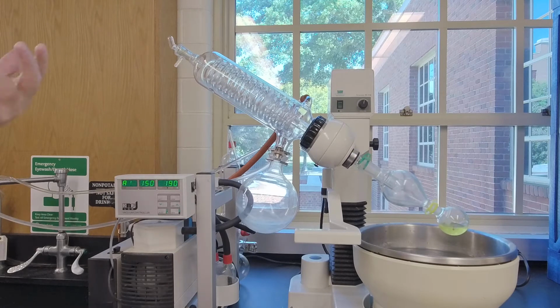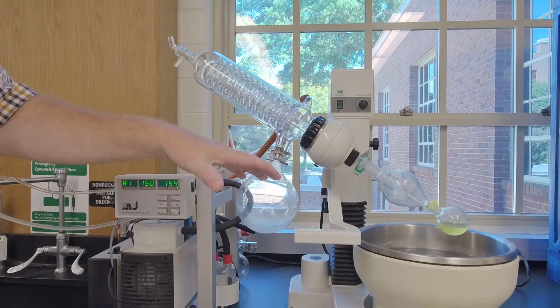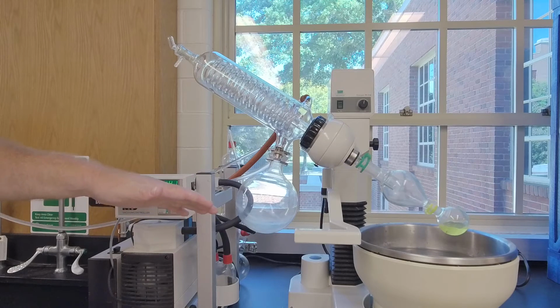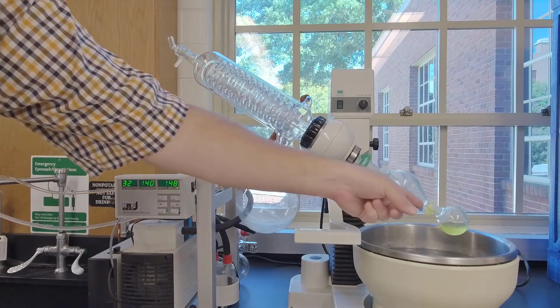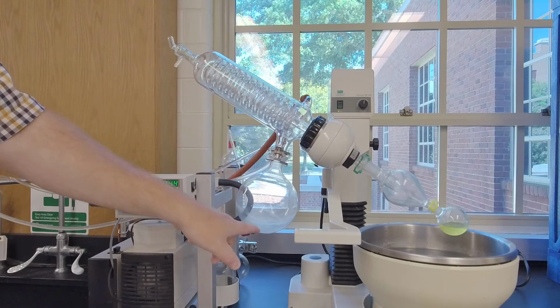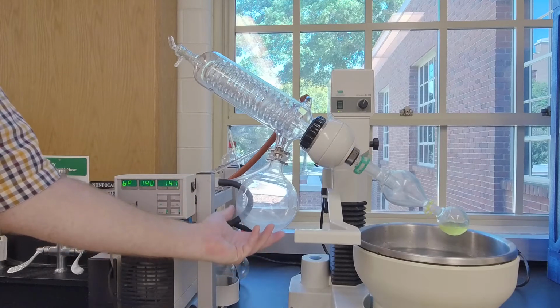All it's doing is condensing a vapor. Okay, so we reduce the boiling point of the substance by putting it under vacuum. We're going to boil the solvent. Solvent's going to come up here, hit the condenser, and condense and come down here into what's called the collecting flask. All right, so hopefully we collect a whole bunch of solvent here.